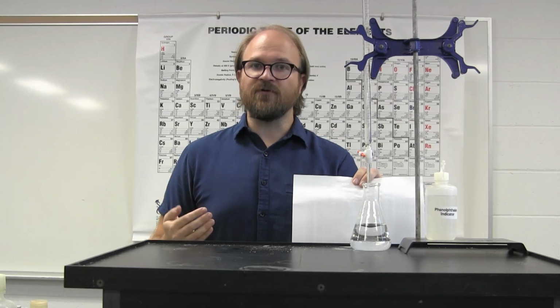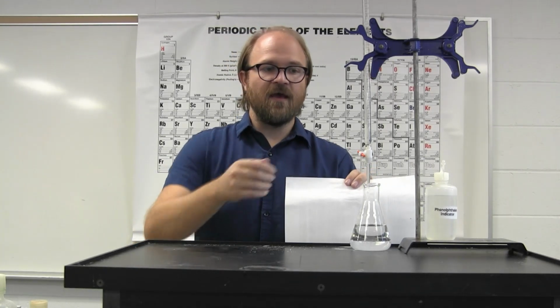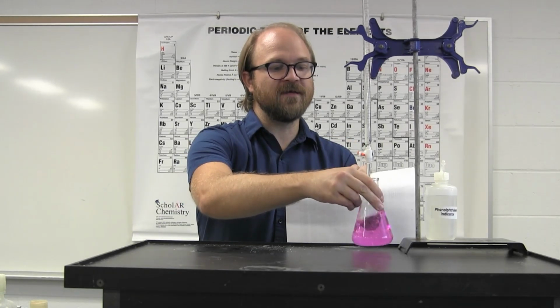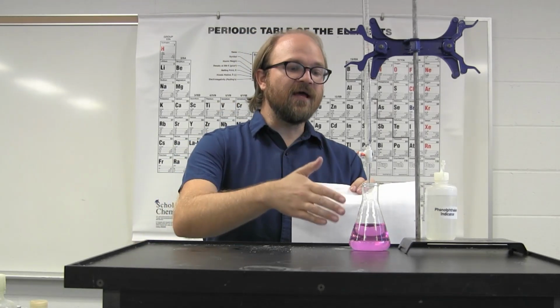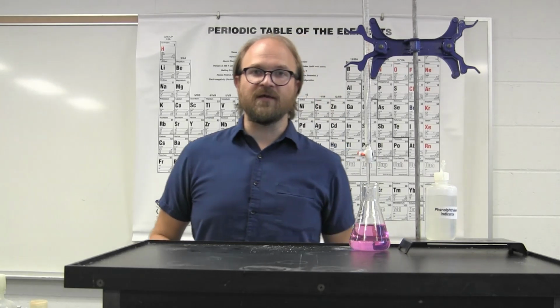In a lab titration, the color change needs to be maintained, and typically for at least a minute or so before it would be considered the titration is complete. You can see the light color change of light pink, indicating that the titration has been completed.